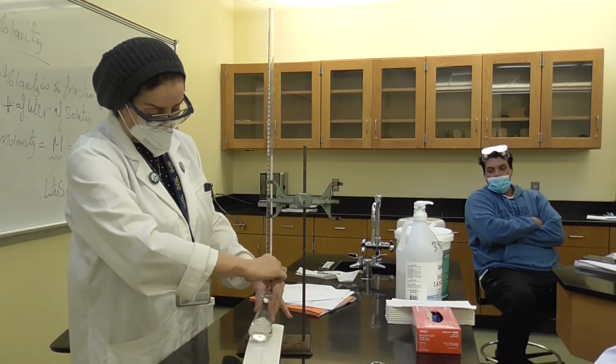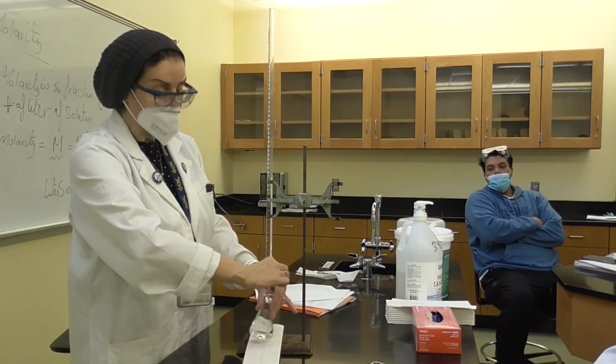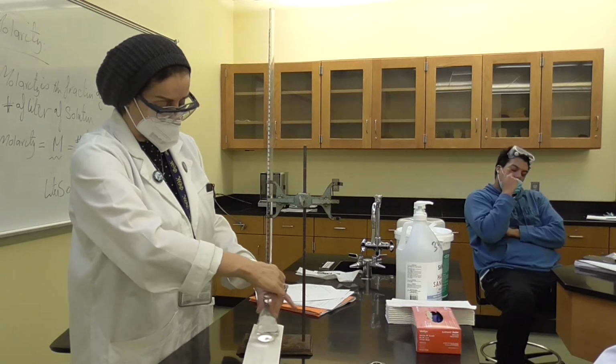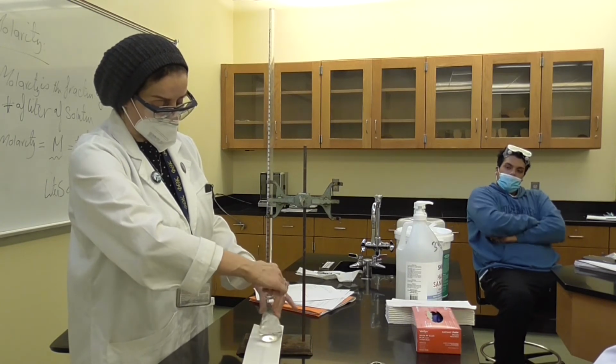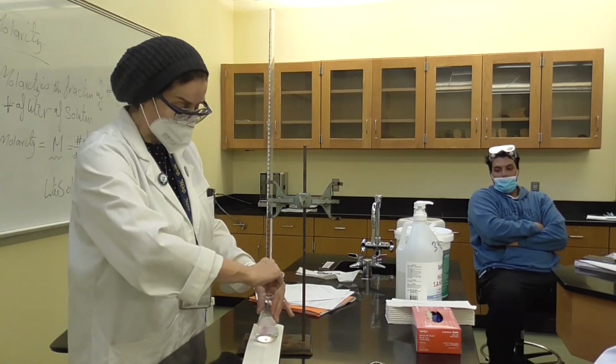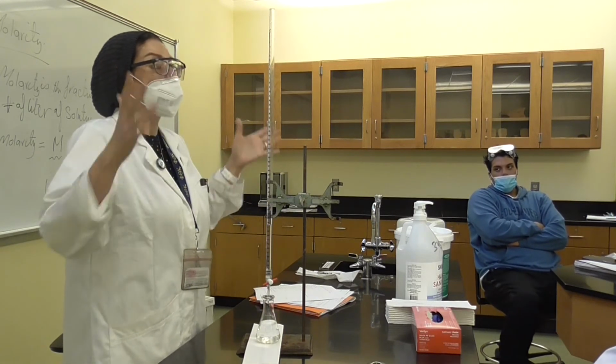And you see here, can you see the pink? Yeah. But it disappears as soon as I swirl it. It doesn't stay. So I'm going to keep adding, and most likely I know how many ml from the previous class, but you have to be very careful when the color is going to be retained longer.